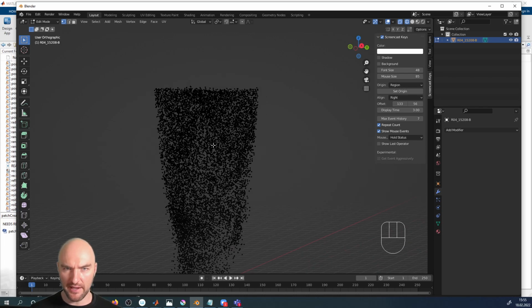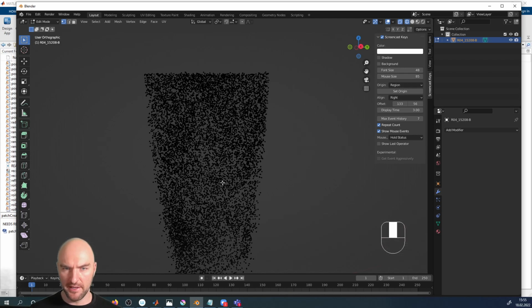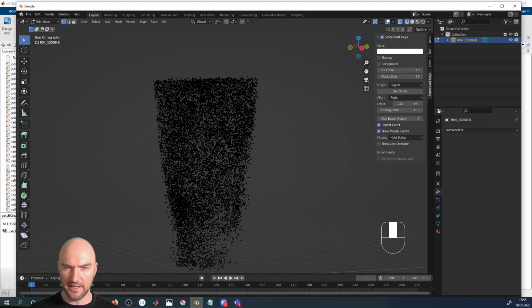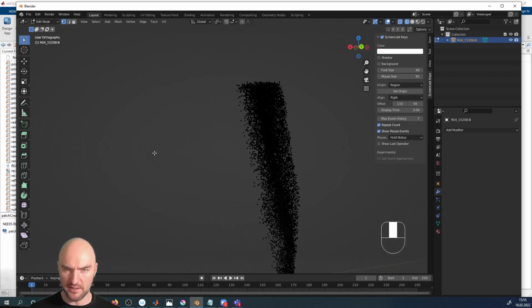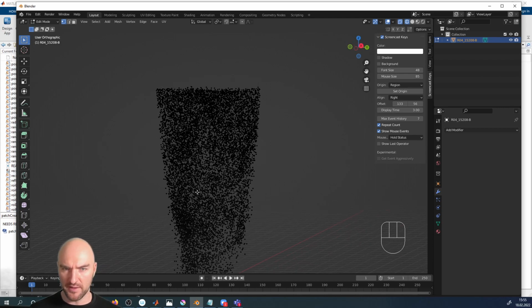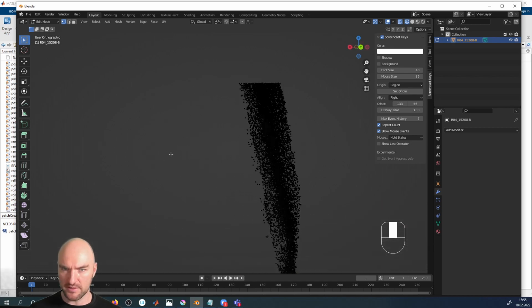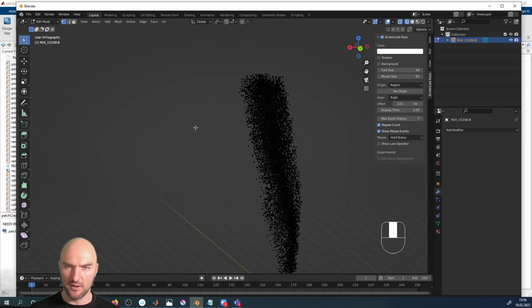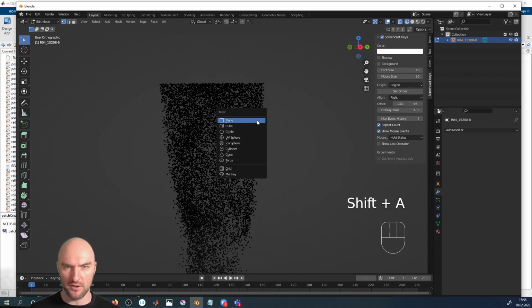And we can see there are certain regions like up here where we have more, and here where we've got less, and here a little bit more, and here a little bit more. So there's certainly a distribution of boron on that interface. I don't know if that's a precipitate starting or whatever is happening there, but there's certainly some kind of distribution that will be interesting. Of course, we could now go and start modeling our grain boundaries.